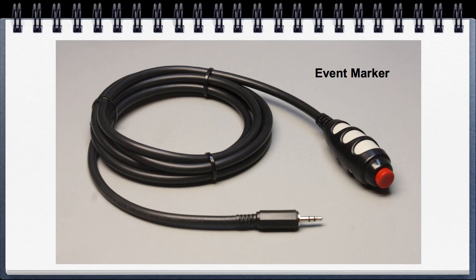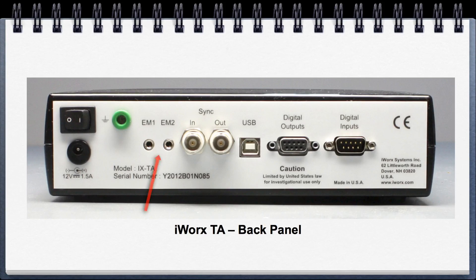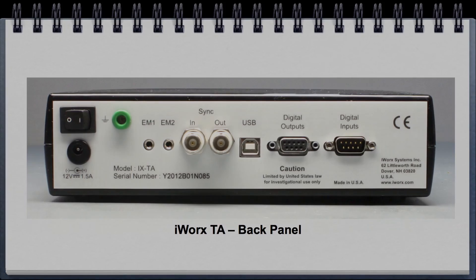Finally, we have the event marker, which connects to the back in either EM1 or EM2. We have the USB connector to hook up to your computer, and finally, the switch to turn the unit on and off. And that's the iWorks TA — please see the iWorks TA Control Module documentation for further information.